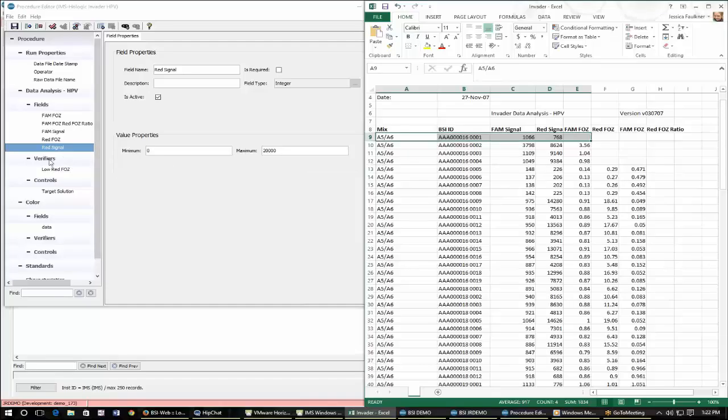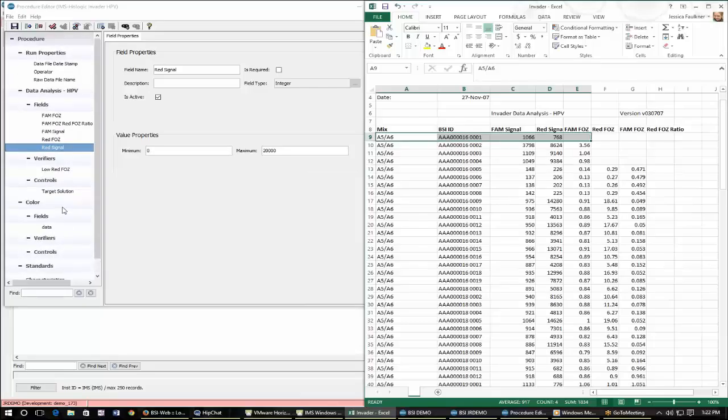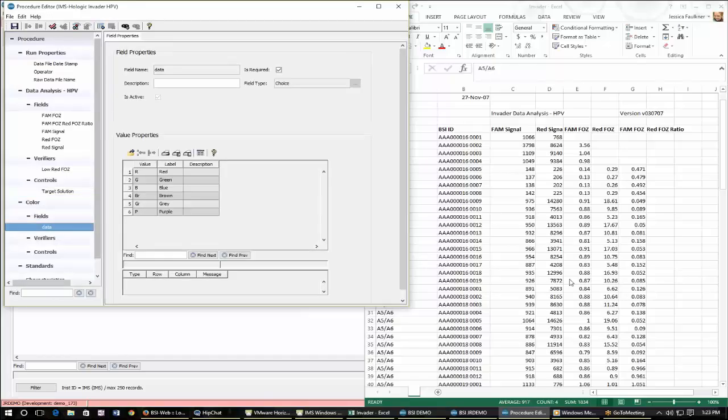And then I have another data set here, called my color grid data set, and that's representing the bottom table, the one with the colors on it. So for this sort of data set, you can only have one field since there's only one piece of data that can be held in that table.